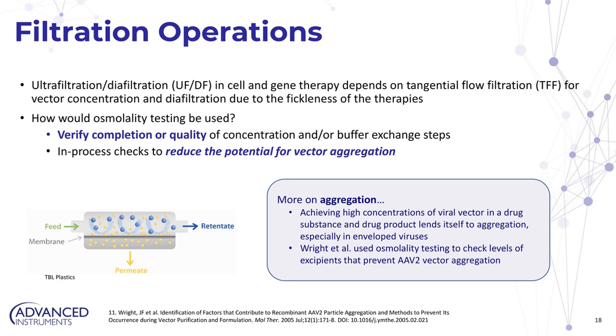So we know that tangential flow filtration, or TFF, is critical as far as UFDF operations within this field, typically due to how delicate or how fickle some of the therapies can be. So the question here is, how would osmolality testing complement these operations? How is it going to benefit? What areas or issues that are currently being experienced within filtration could be addressed by osmolality testing?